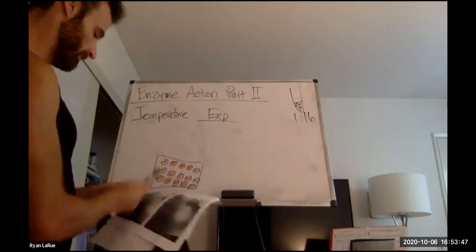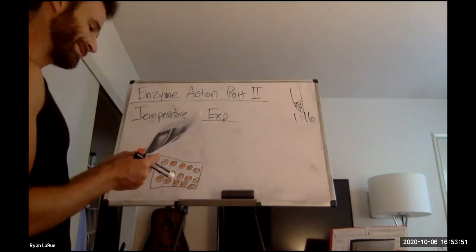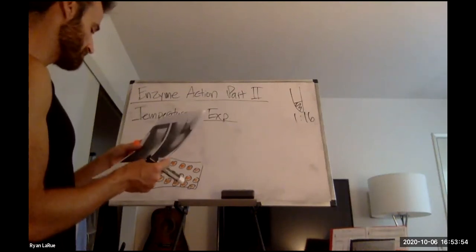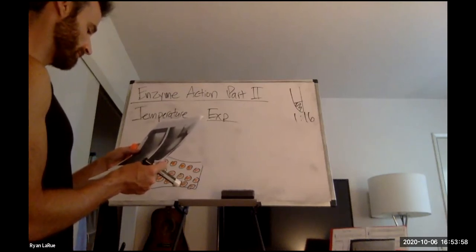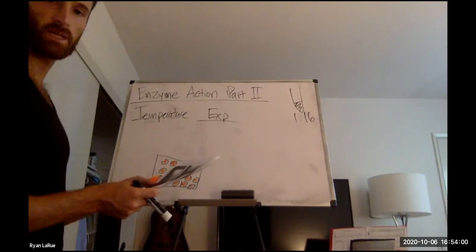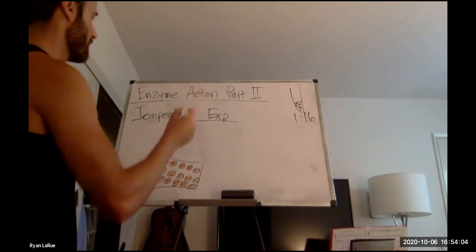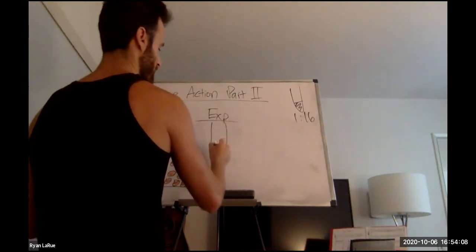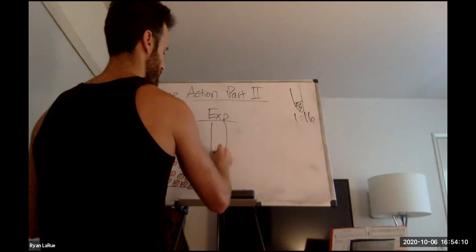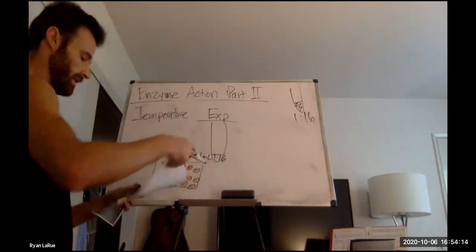All right. So let's do an example. We'll do the 0 degrees freezing temperature, 0 degrees Celsius. So for the temperature experiment, what you're going to do is have your enzyme, your 1 milliliter of your optimal saliva.